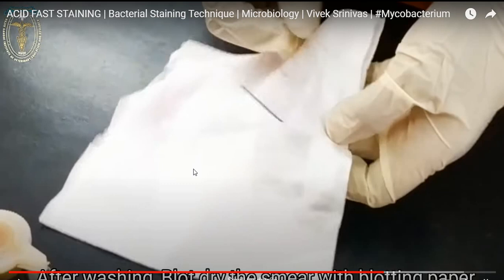Klaro ha? Kung isu-wipe mo, example siya, ginada tanan. The example of bacteria is the Mycobacterium species, which possesses this type of microscopic feature on Acidfast staining technique.